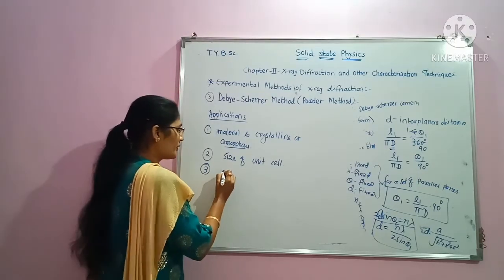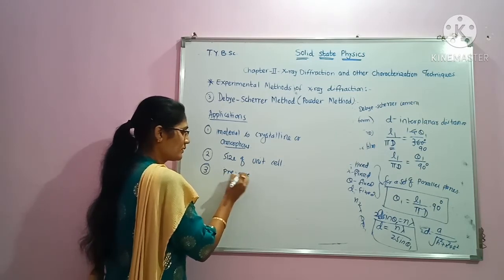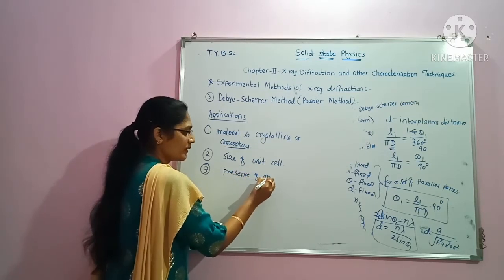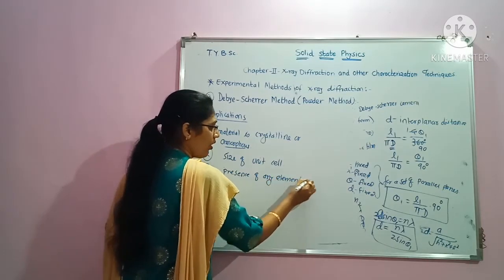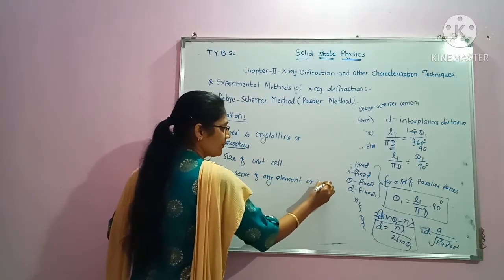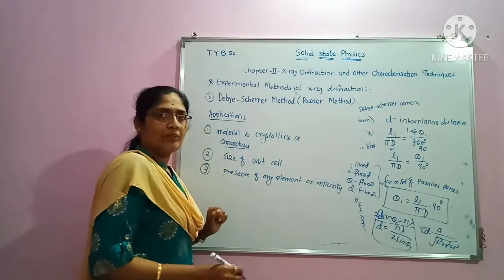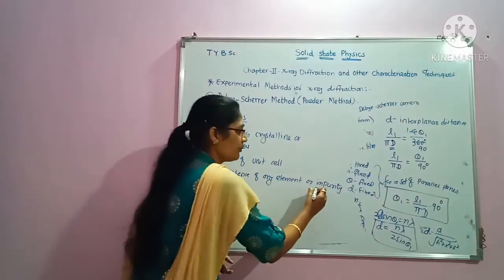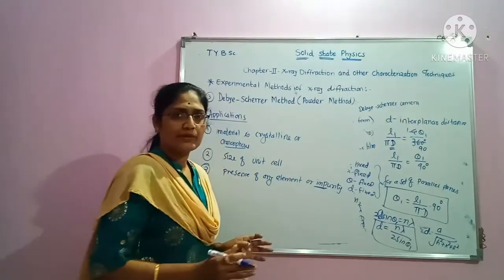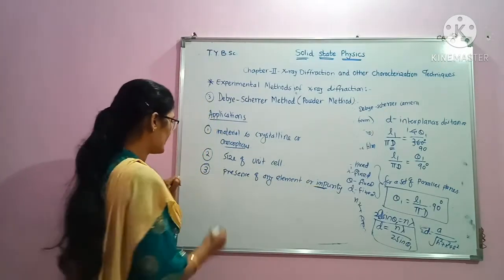Also one can determine the presence of any element or impurity, because the photograph will show the arcs related to value related to that impurity atom.